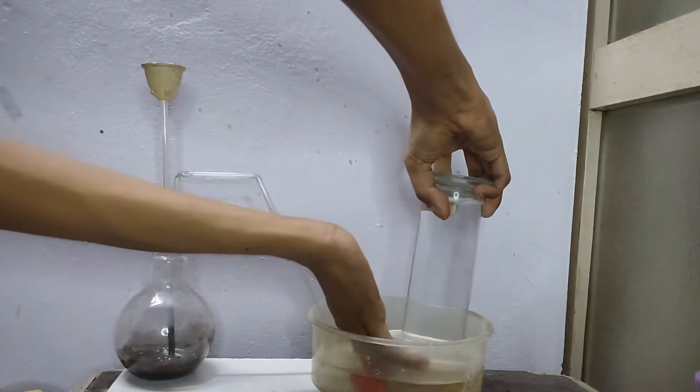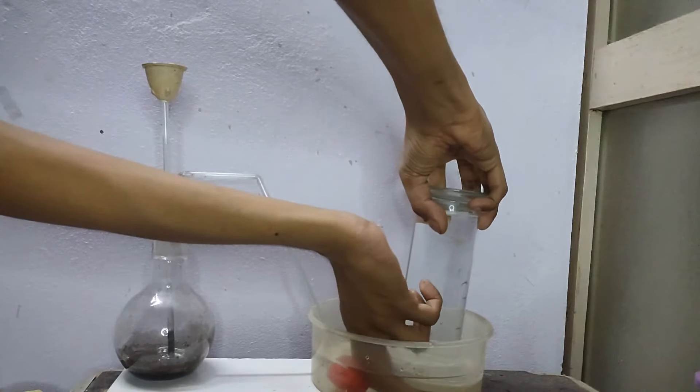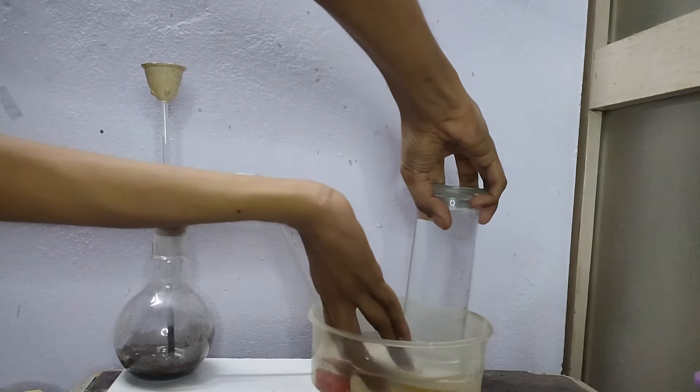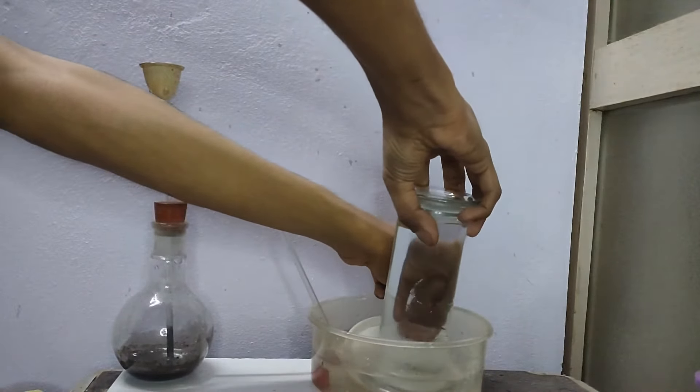This is mostly air. So first we let some bubbles go out and then place the gas jar on top of the beehive shelf to collect our oxygen by downward displacement of water.